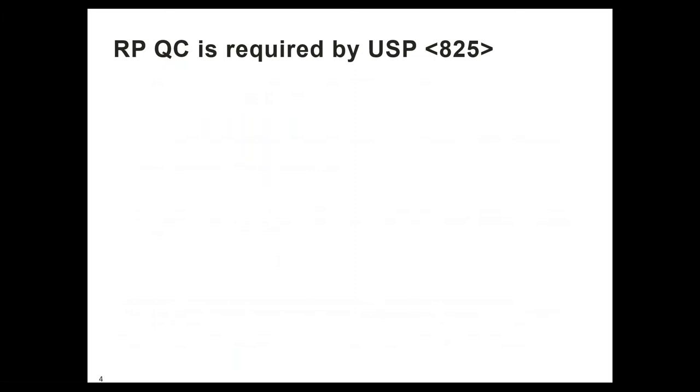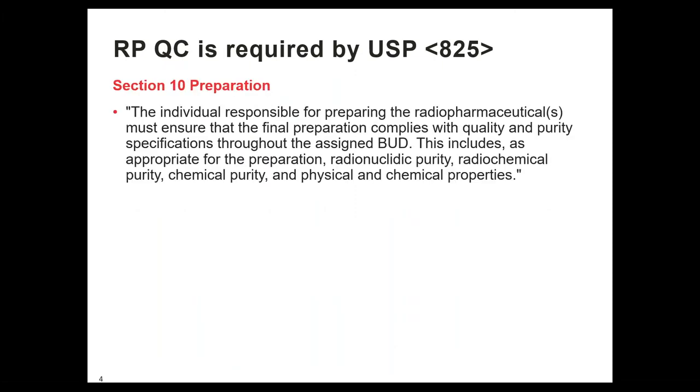QC testing of radiopharmaceuticals is required by USP, and here's the direct quote. It's found in section 10. The individual responsible for preparing the radiopharmaceutical must ensure that the final preparation complies with quality and purity specifications throughout the assigned beyond use date. This includes, as appropriate for the preparation, radionuclidic purity, radiochemical purity, chemical purity, as well as physical and chemical properties.